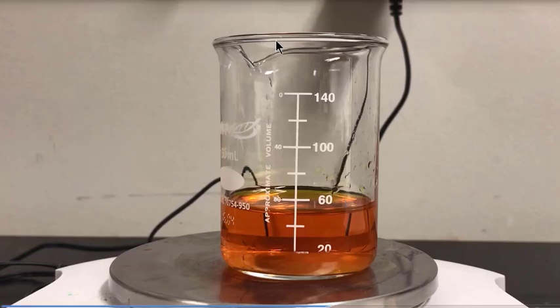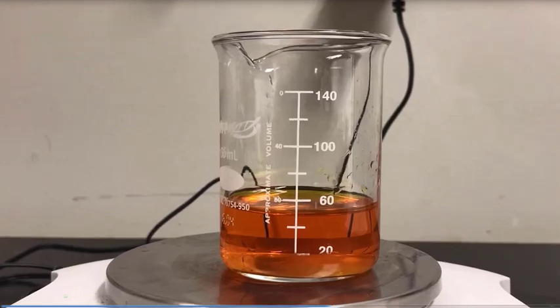You can see I've also added a little bit of dye so we can see the water level a bit more clearly. So I did cheat a bit just for the sake of the video. And our 40.04 grams of water has a volume, well there's 40 there and there's 60, so it has an actual volume of about 49 milliliters. I think that's slightly less than halfway between the 40 and the 60, so I'm going to judge that as 49. So that's what the flat bottom beaker thinks the volume of this liquid is, 49 milliliters.